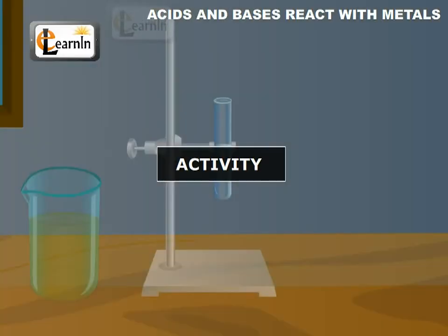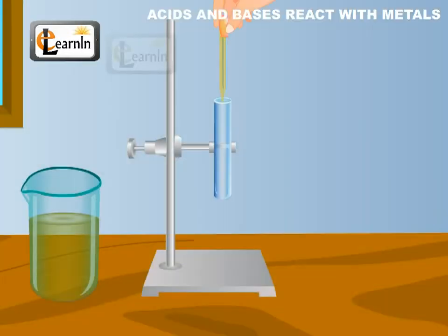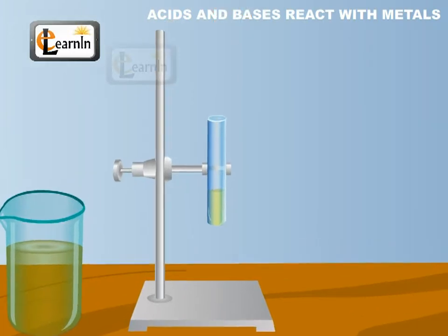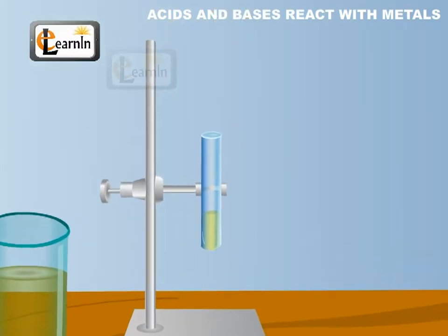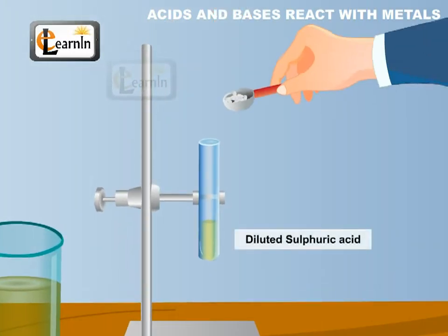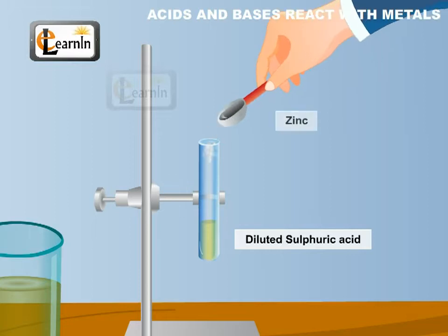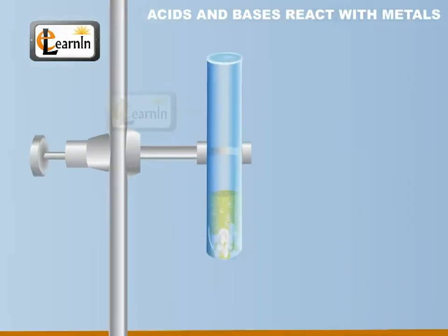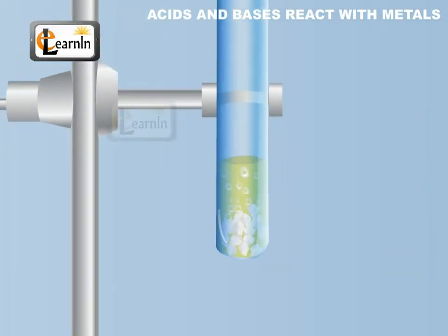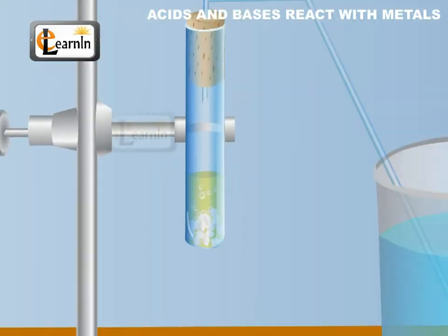Acids and bases react with metals. This activity will help us understand the chemical properties of acids and bases when they react with metals. Take about five milliliters of dilute sulfuric acid (H2SO4) in a test tube and add a few zinc granules to it. You will observe some gas coming from the surface of the zinc granules.